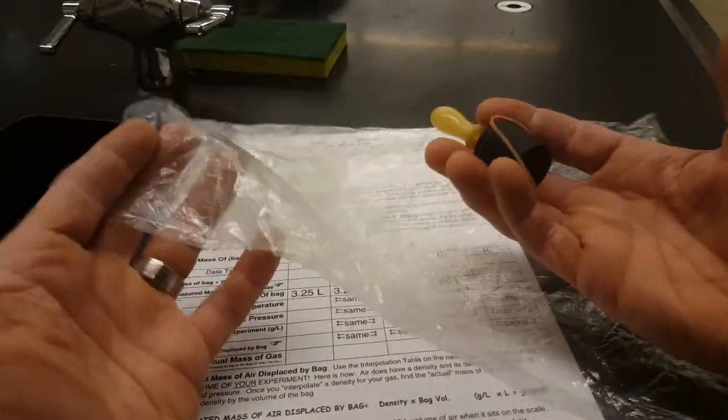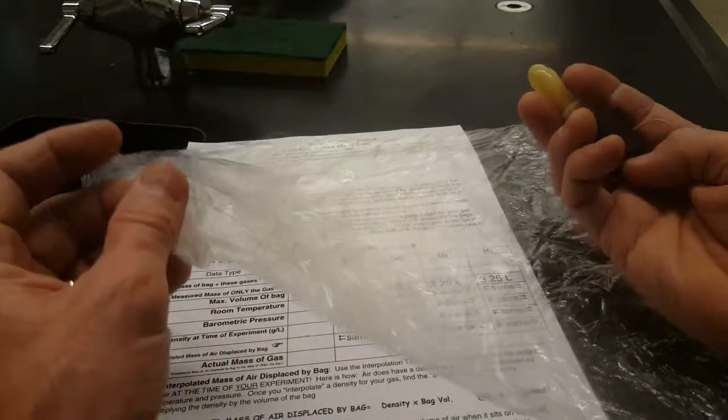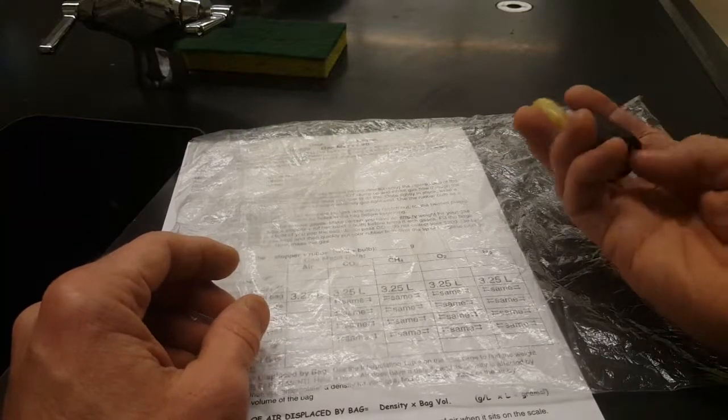So that's the problem with this lab we're trying to solve: we're weighing gases in a gas. And the gas itself, which is the atmosphere, is going to make the gas in the bag appear on the scale to weigh less because of buoyancy. Thanks, Archimedes. Now our job is to do some mathematics and try to figure out what the mass of the gases in this bag are.